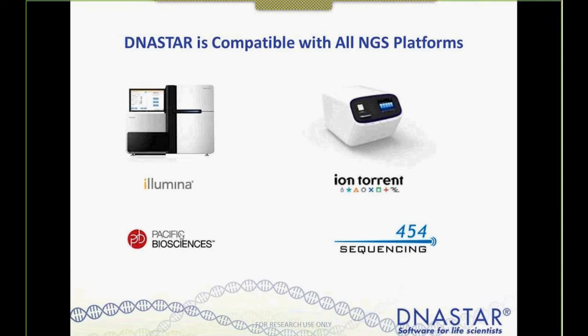DNASTAR is compatible with all the NGS platforms. So what we'll be talking about today is mostly Illumina. Illumina has really set the benchmark for accuracy. And so to get the most accurate assembly and analysis, we'll choose Illumina data to do that.